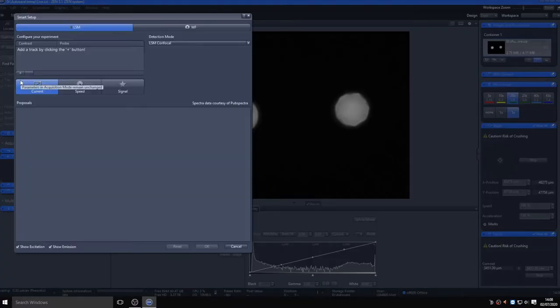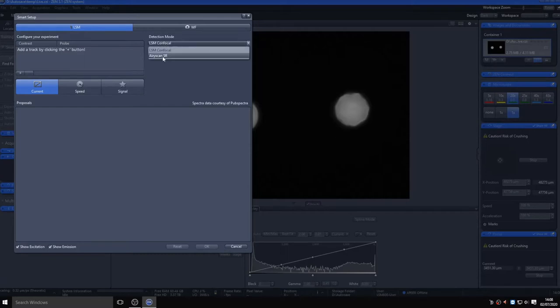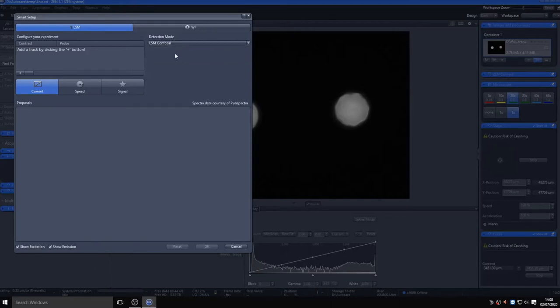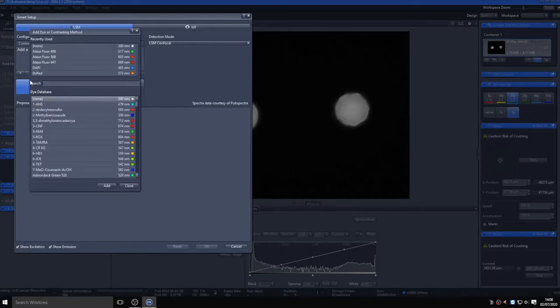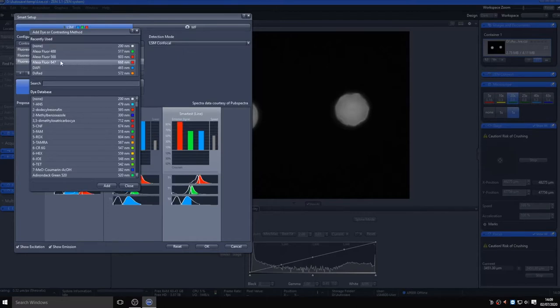At this point you can select either LSM mode for standard confocal or Aryscan super resolution. To begin with, select confocal and tell the system what fluorophores you are wanting to visualize using the plus button. In this case, we will tell the system we are looking at DAPI, Alexa 488, Alexa Fluor 568, and Alexa Fluor 647. Although the sample on the stage is autofluorescent pollen, this will set the system as if we were wanting to visualize the four fluorophores, adapting the emission wavelengths as it thinks best for each.